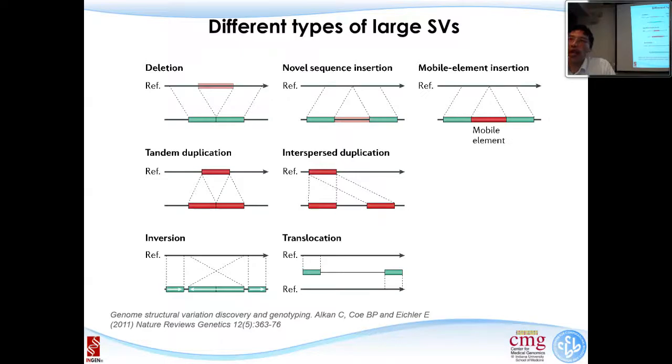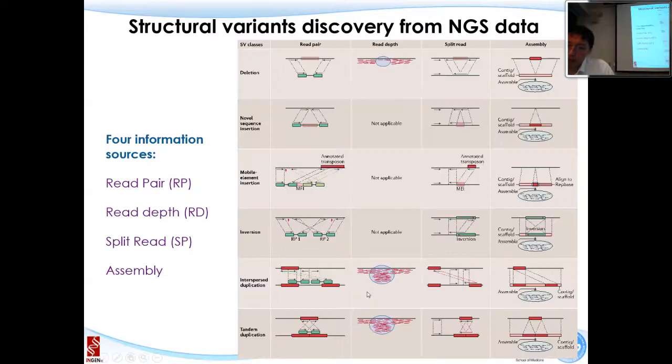For some known ones, where we already know they are in a certain part of the genome, like 1q in multiple myeloma, or 17q in some others, you can use FISH technology to pull down those regions and identify them. But finding large structure variations de novo was almost impossible.